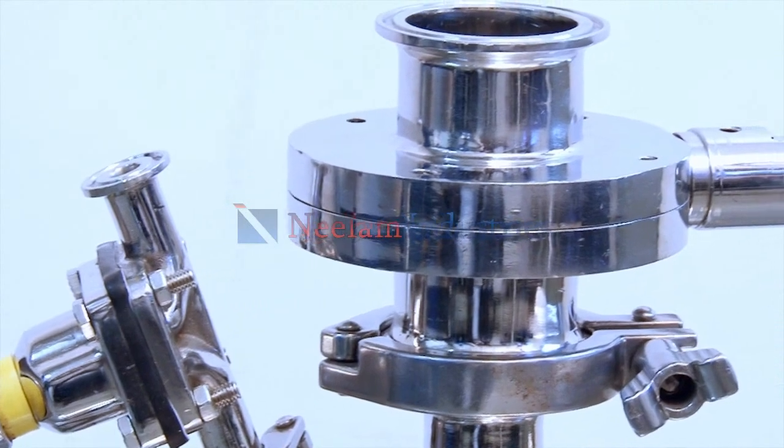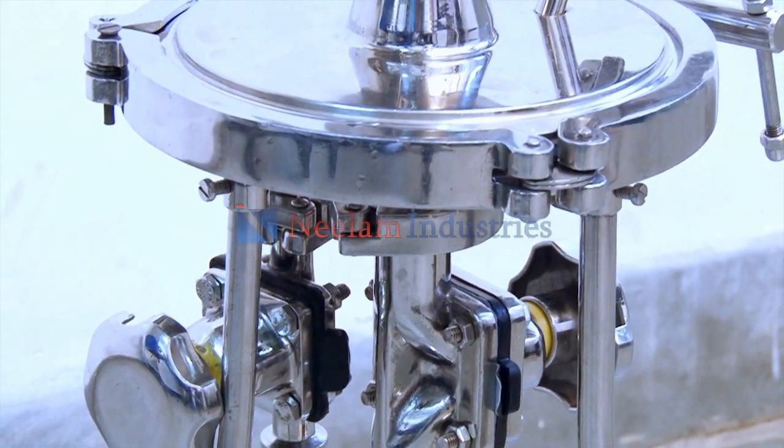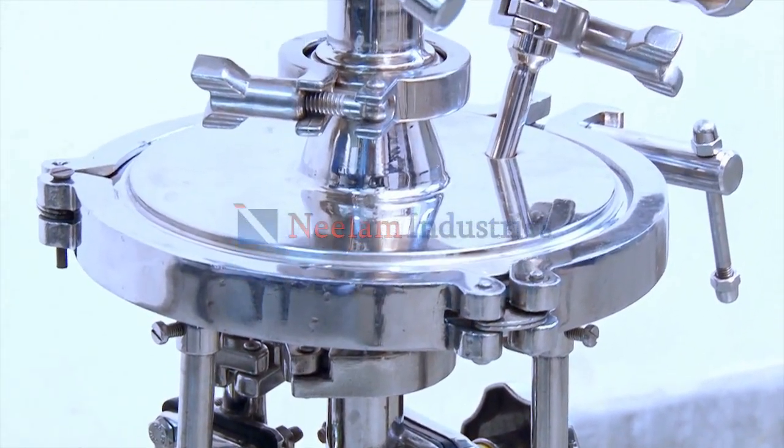The whole membrane filter holder is designed with tri-clover clamp for easy opening and closing of the membrane filter holder.